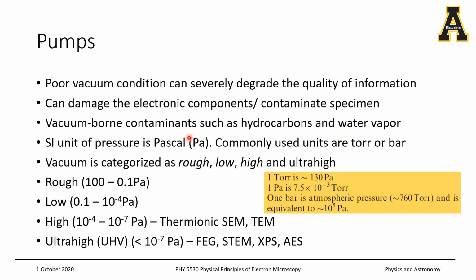And also think about it, if you don't have good vacuum in your electron column, this layer of water vapor or hydrocarbon is going to accumulate over time on your electromagnetic lenses, your aperture and stuff. So as I said, this is probably one of the most important aspects of any ultra high vacuum system, especially any imaging system that relies on the proper transmission and collection of electrons.